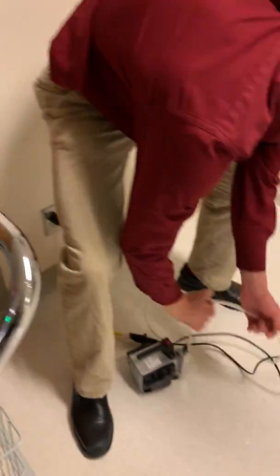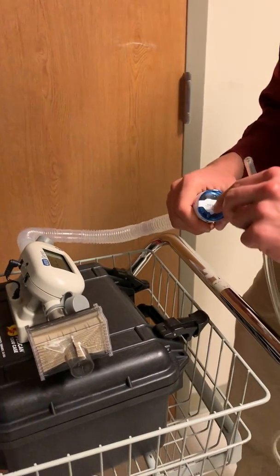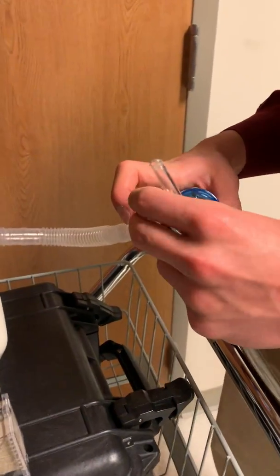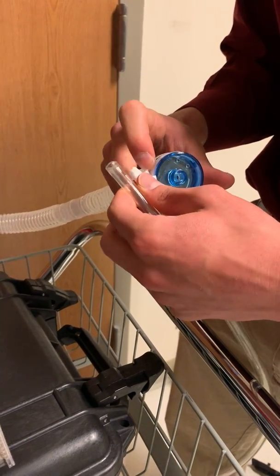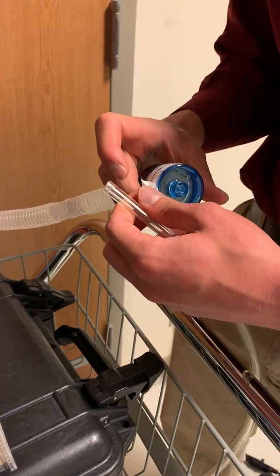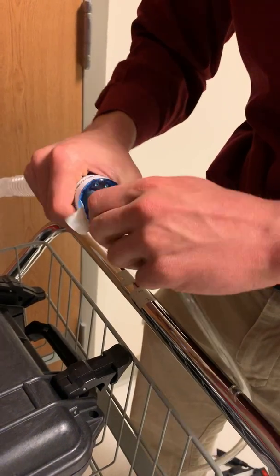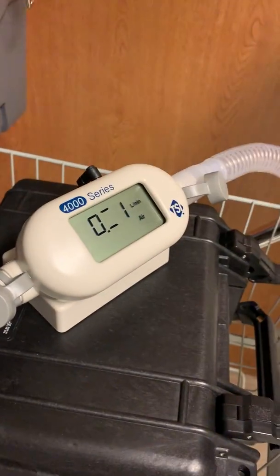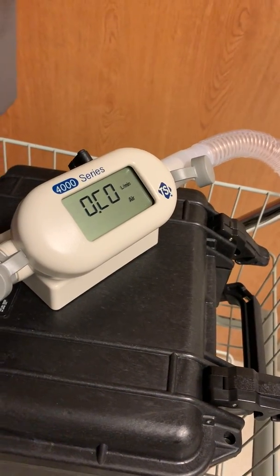Then we're going to take our aerosol pump and put it within the calibration cassette. At our hospital, EM Labs recommends that you run the aerosol pump at 15 liters per minute. This calibrator calculates flow rate, so once I turn it on we're going to wait until it reaches at least 15 liters per minute.